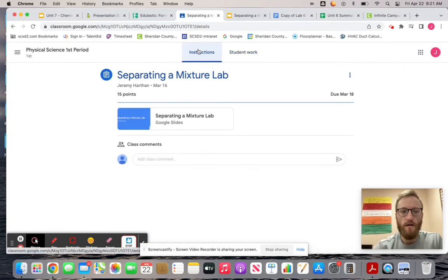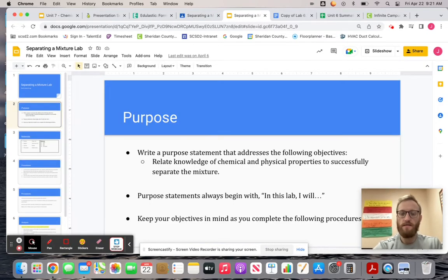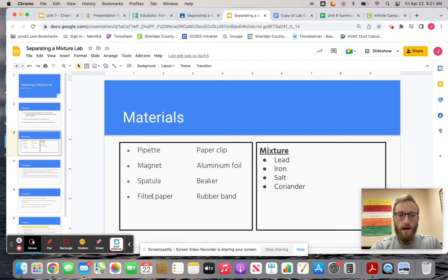If you look at this one, it's got these slides on here. That's where we're going to find all the questions we need to do in our notes. First, we were looking at the difference between element, compound, and mixture, and how we can separate mixtures. We had a mixture with little tiny lead BBs, iron filings, salt, and then coriander. Apparently coriander is actually a real thing. I just found that out, but it looks like a little tiny round seed. We had these all mixed together.